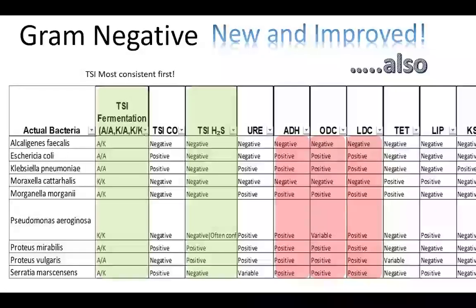These 3 tests, the ADH, ODC, and LDC tests, are not good ones to rely on, because we've had some issues with them being consistent. We're not exactly sure why, so we're just going to let you be forewarned. Those 3 tests are not crucial to identifying your bacteria, okay?